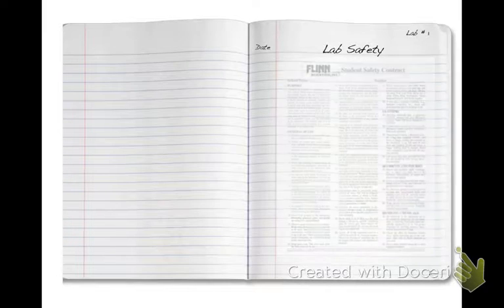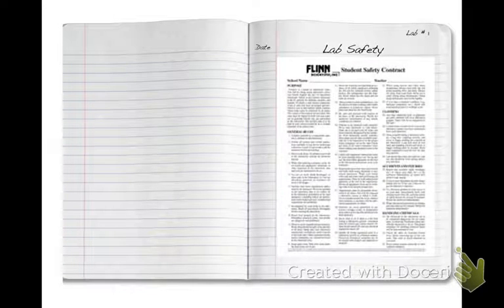So what you'll do is take that safety data sheet, the safety sheet, excuse me, and cut that in half, put one half in here, make sure you tape the top and the bottom, and put your initials on both sides. So your initials and the date should be both on the paper that you're adding plus the actual composition notebook. That way, in case something falls out of your composition notebook, you can still at least see half of your initials and the date, so we know that there was something in there to begin with. Right? So that's the first side.